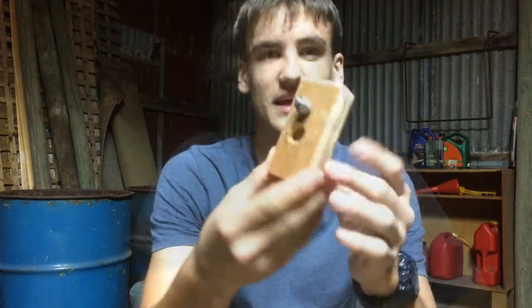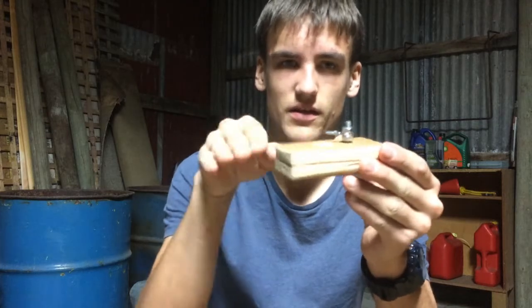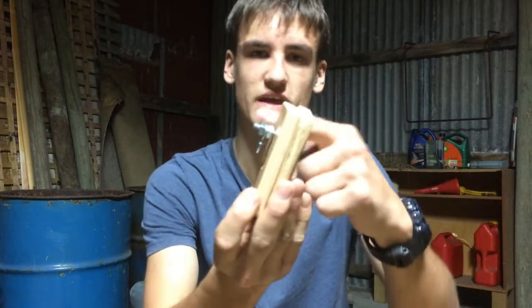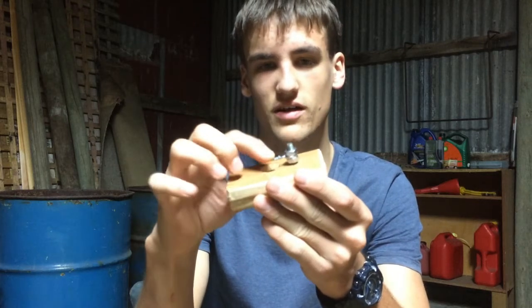Basically his design had two bits of metal that had a lens in between. I've just got two bits of wood here and then I've got this bolt that's through there, and the microscope should hopefully be focused on the tip of this.